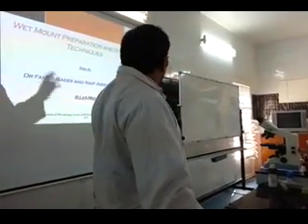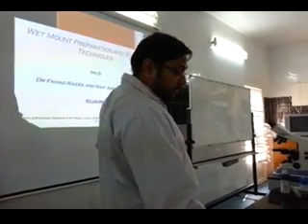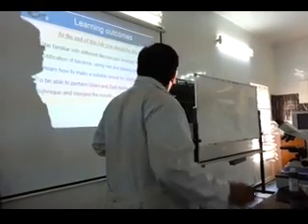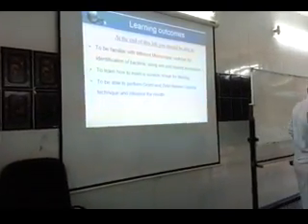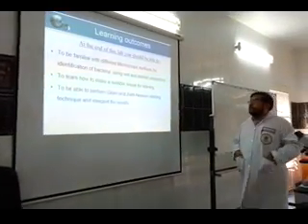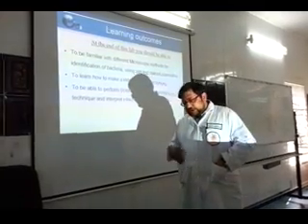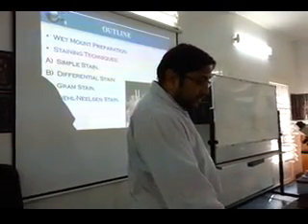There are some techniques. We will leave out the wet mount. We will do gram staining techniques for you. So we will see different methods of staining, how we give color to the bacteria. There can be two types: one is general staining or simple stain, and the other is the differential stain.